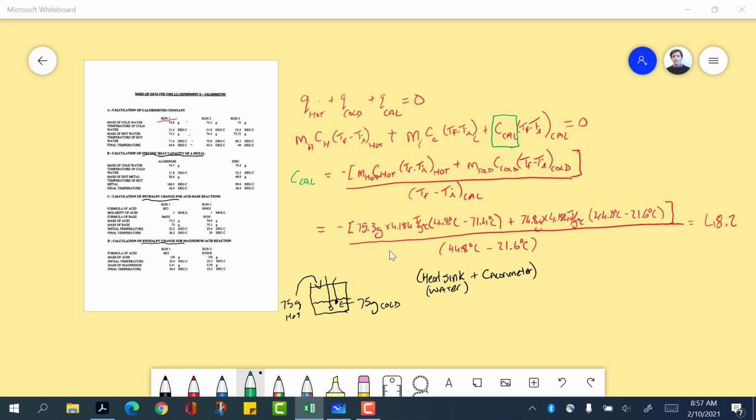And then you would record the temperature. So in this one, let's erase this, you would take heated aluminum pellets. You'd have a test tube, and you'd have your pellets in it along the bottom, and these would have been heated in a water bath, and you'd measure the temperature of that water bath, and that'd be the initial temperature of your pellets. As I said, you put that in the calorimeter and then mix it and record the final temperature.